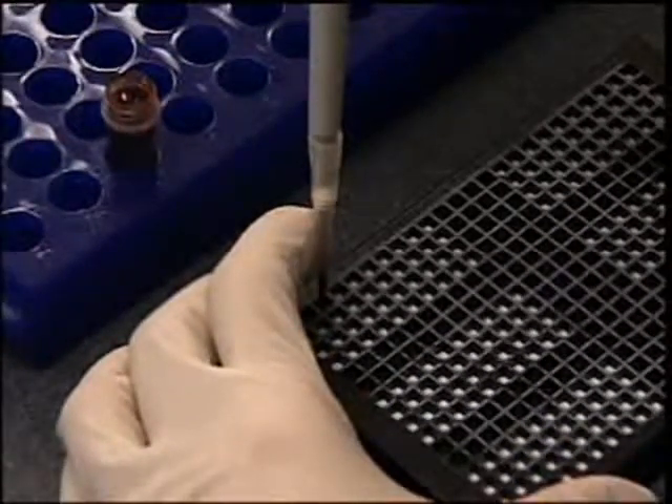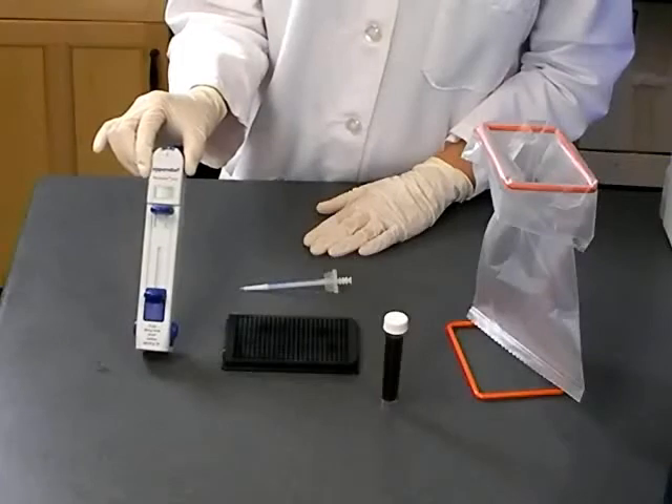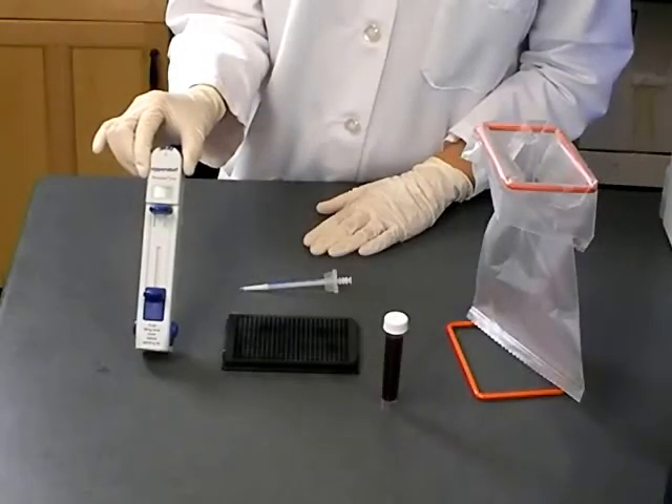Simply repeat this step until you have applied your entire sample to the GenPlate. A repeater pipette is a useful tool if you will be applying a single sample to many wells in a GenPlate.